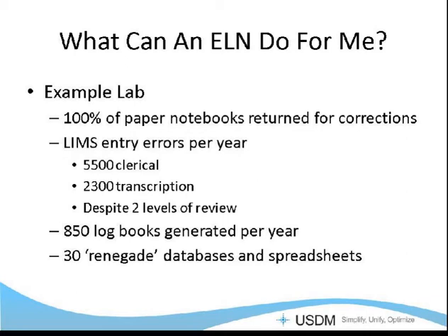There were different logbooks for different purposes, and they shared some data, so data had to be entered into multiple logbooks. And analysts had 30 what I call renegade databases and spreadsheets, basically Access or Excel, that they used to actually do the work they needed to do, because the paper notebooks don't allow for analyzing information, so people basically had to re-enter it into these spreadsheets.